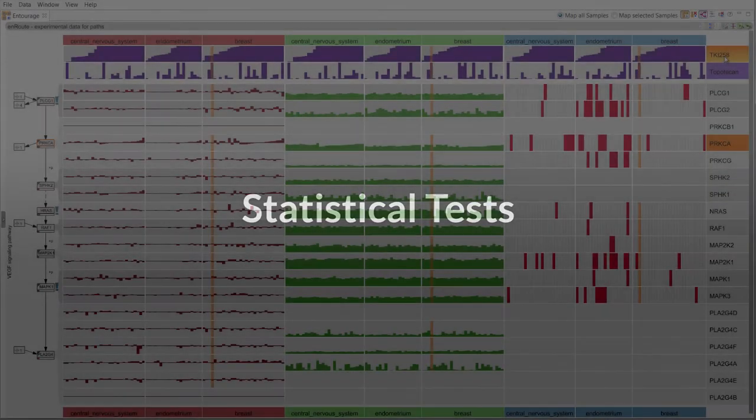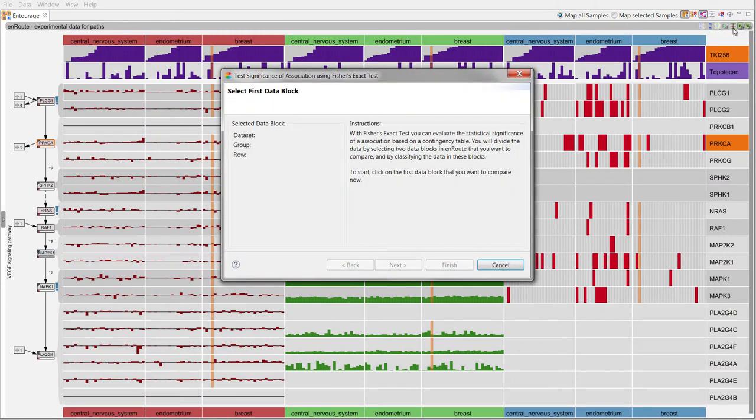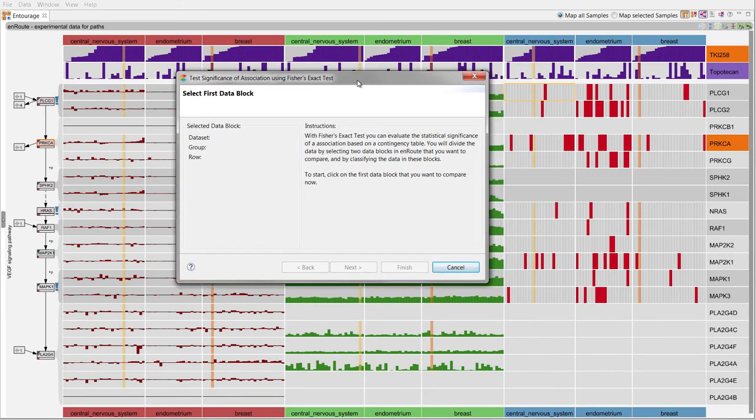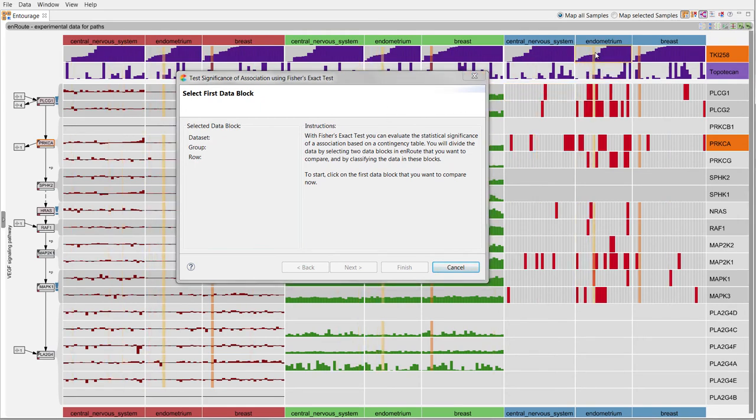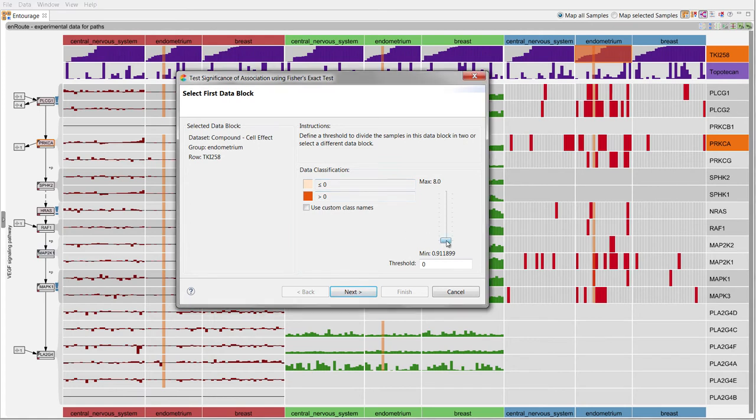We provide statistical tests to evaluate the significance of associations between different blocks of data. To run Fisher's exact test, we use a wizard to divide one data block into two classes. In this case, we set a threshold for classifying endometrium samples into those sensitive and those not sensitive to TKI258.